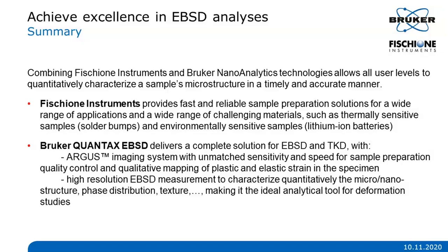Okay, do you want to answer another question, or should I ask the EBSD one? Ask one EBSD. And yes? Okay, because you have a lot of questions. So, yes, is it possible to measure a non-conductive sample with EBSD?